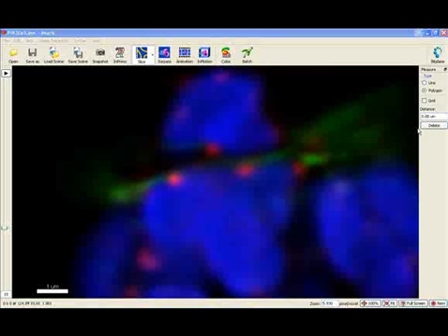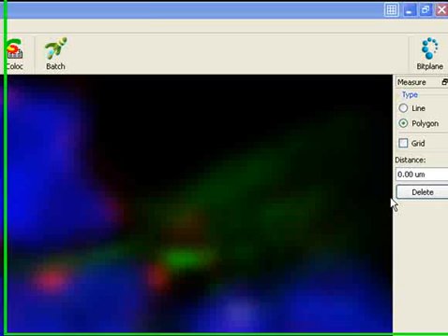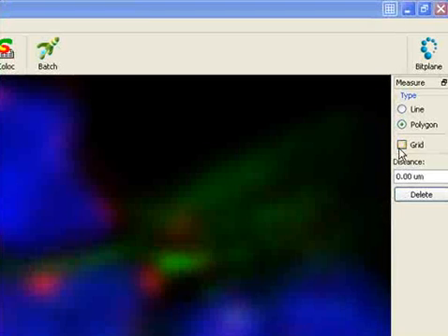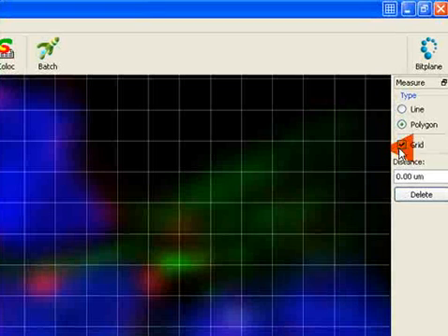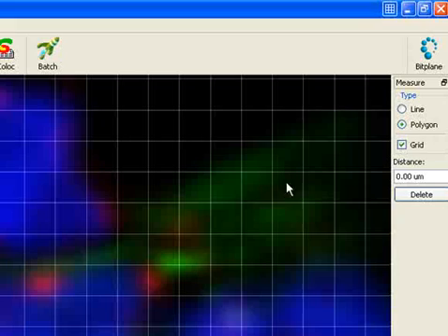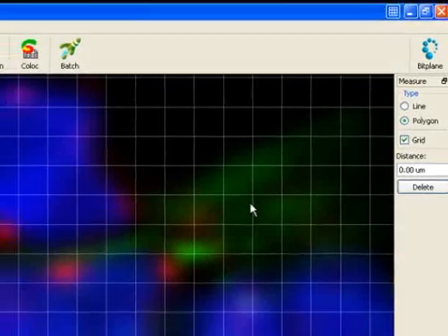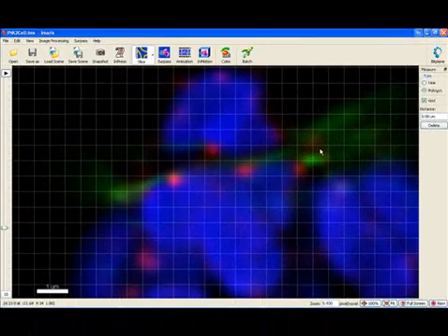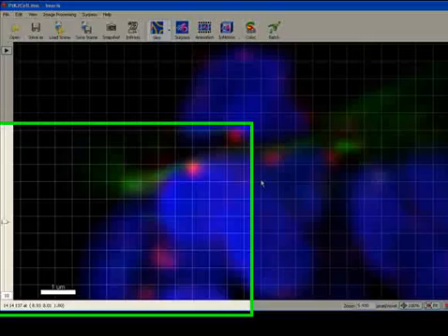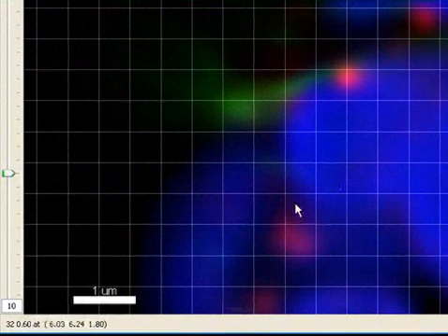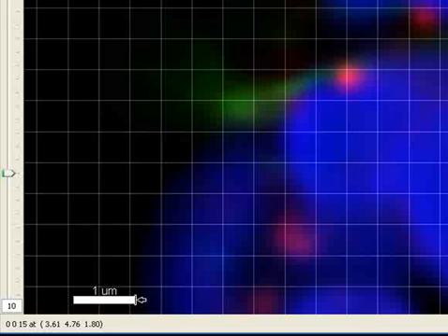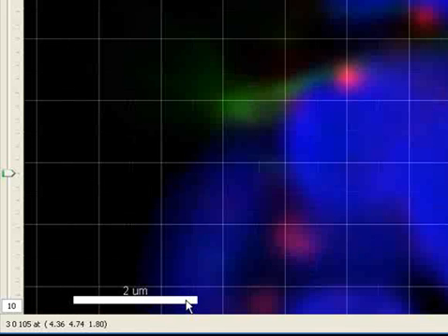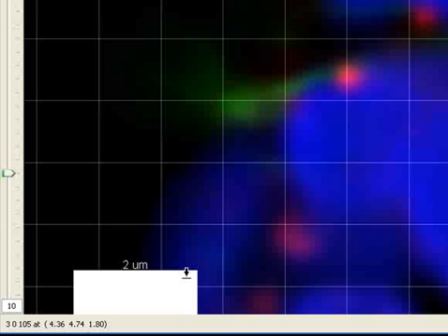Another way to estimate distances in the image is to use the grid display. Select the option grid and grid spacing is overlaid on the image. Click on the end of the grid line to adjust the grid. You can alter the length, width, location and font size of the interactive scale bar.